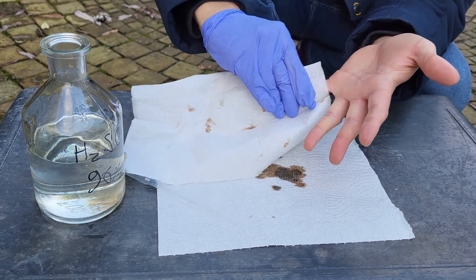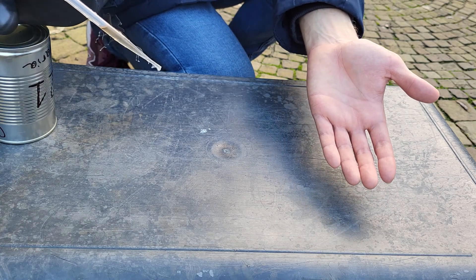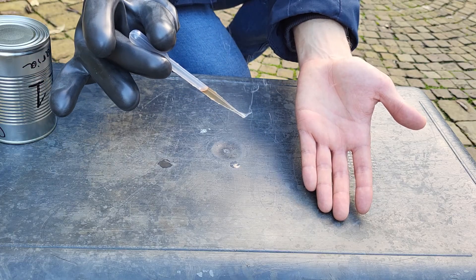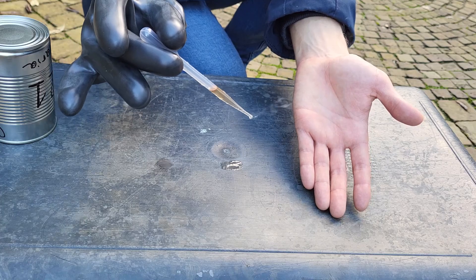Please refrain from repeating any of these experiments at home. Now let's repeat this experiment using super acid. You thought I'm that stupid to pour super acid on my skin? No thanks, we'll use some pig skin instead for that.